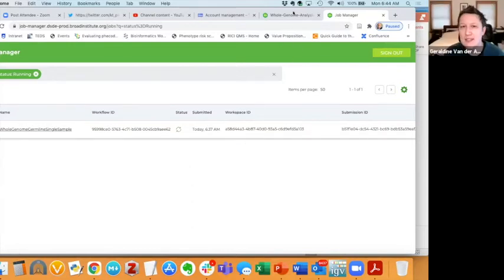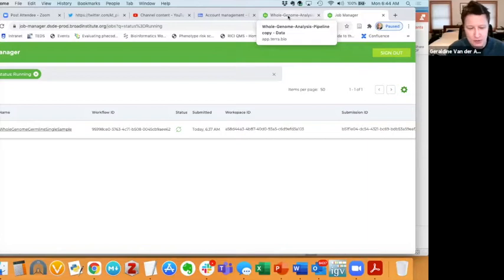Well, it's a little more than just the number of lanes on a plate, because within the same lane we multiplex multiple samples. So the same sample is mixed in with a bunch of other samples within a lane, and it's also spread out across different lanes with different samples. Sure.